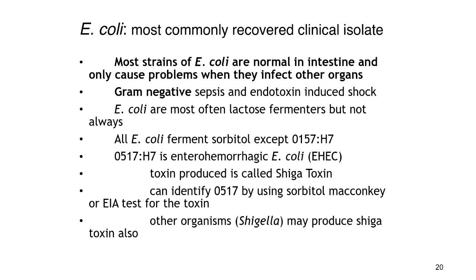E. coli are most often lactose fermenters, but they're not always, so you could use a MacConkey plate. And again, a lot of this other information is here for your information, but there's not going to be a test question about what is O157:H7, okay? I'm not going to put that on a test, but I would ask, is an E. coli gram negative or gram positive? And what does it look like? It's a bacillus, a rod-shaped gram negative organism.